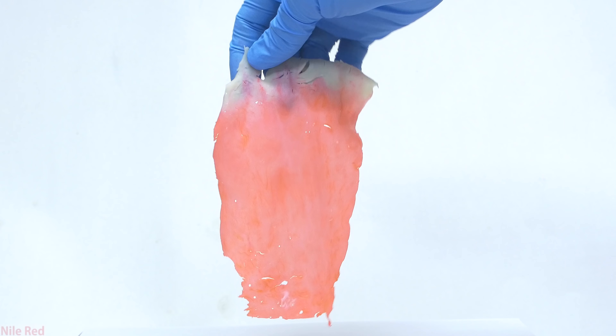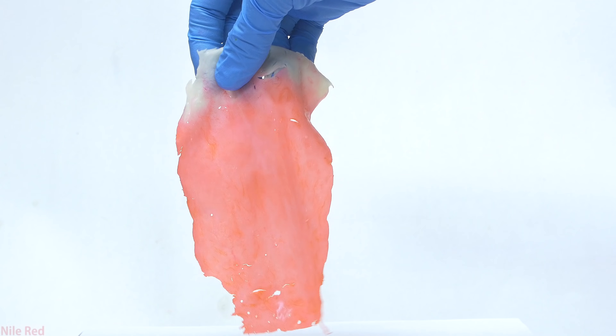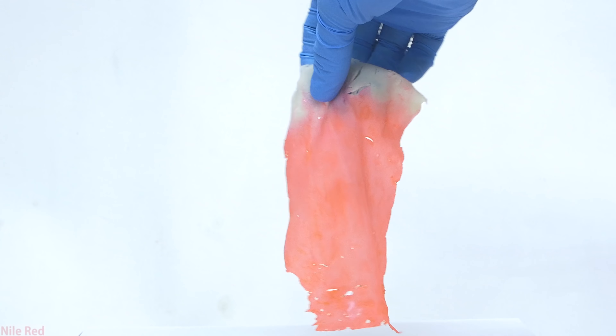At the end of the video I'll use the eosin to dye some things, but be aware that I'm not set up to do any proper biological staining, so it's not going to be very impressive.